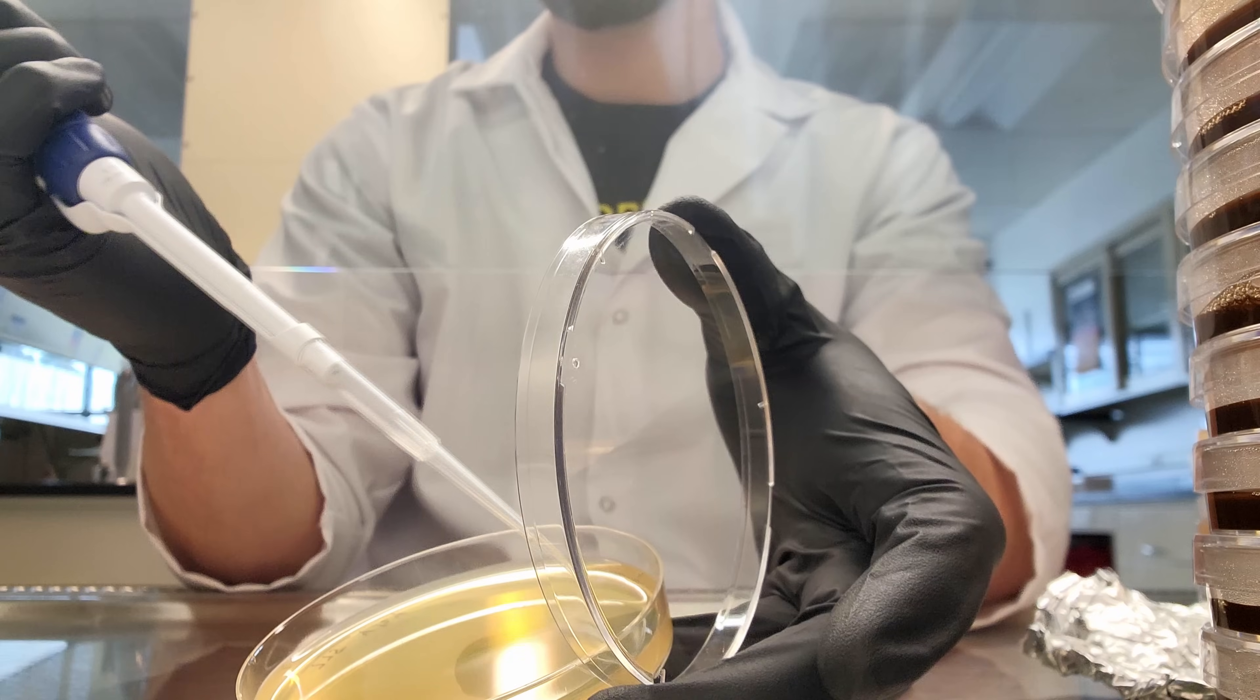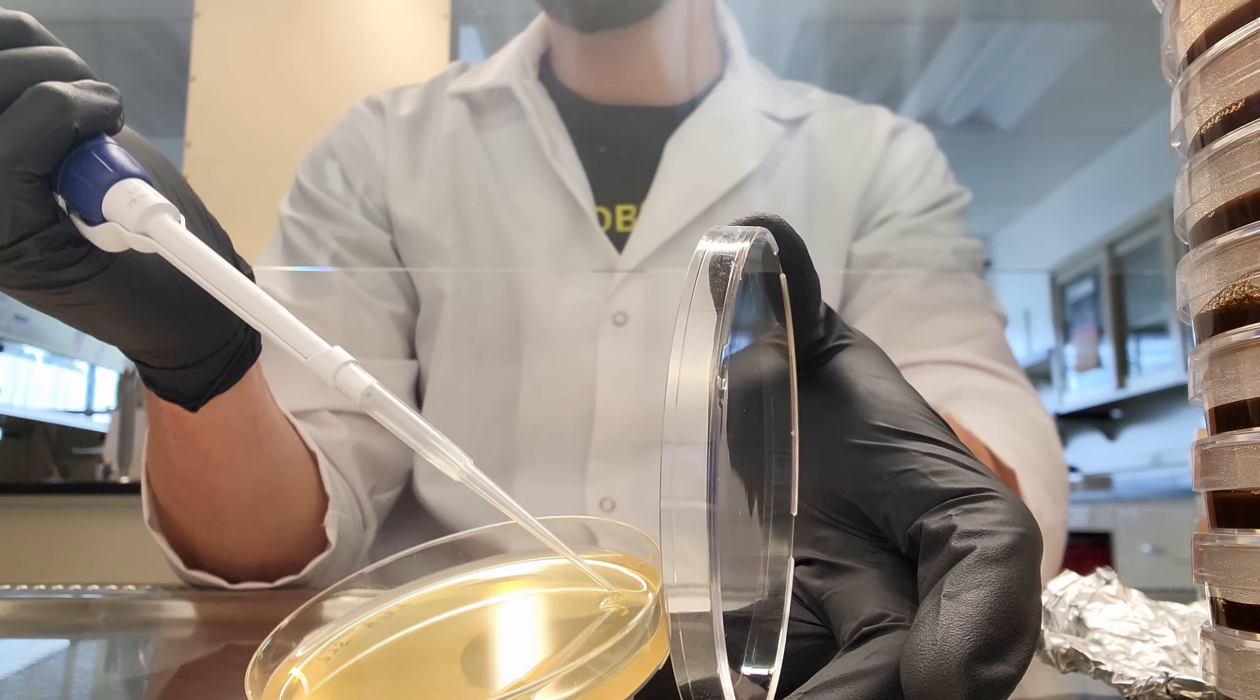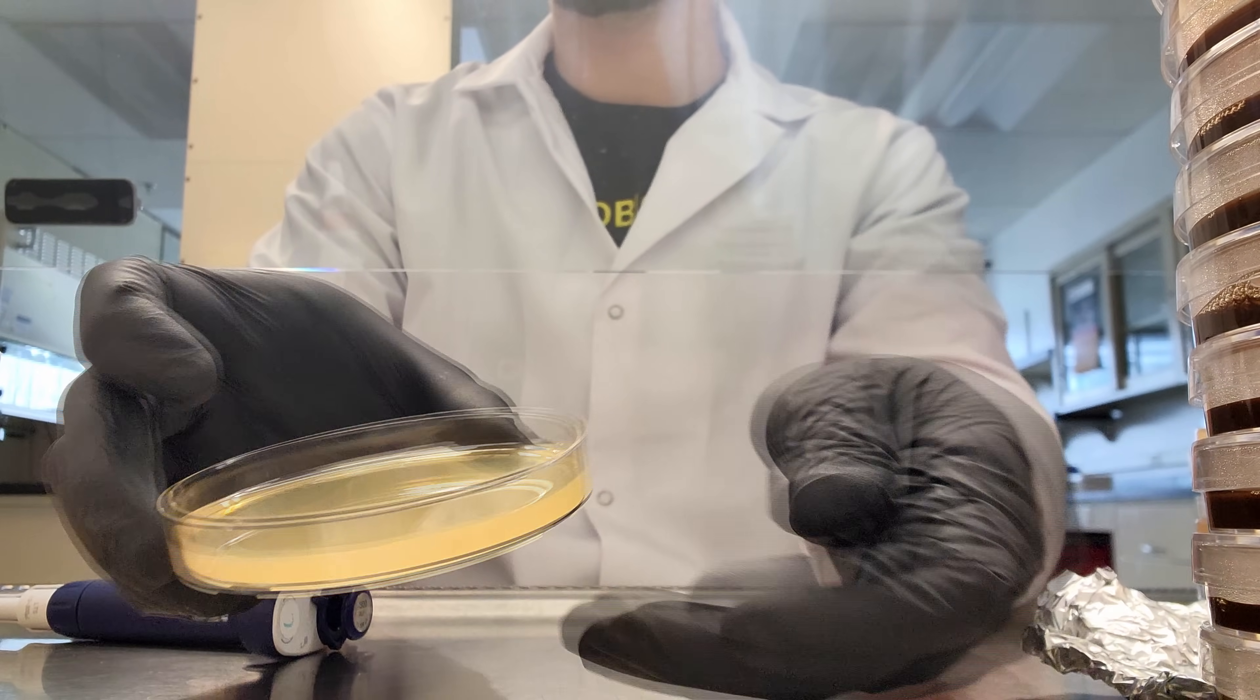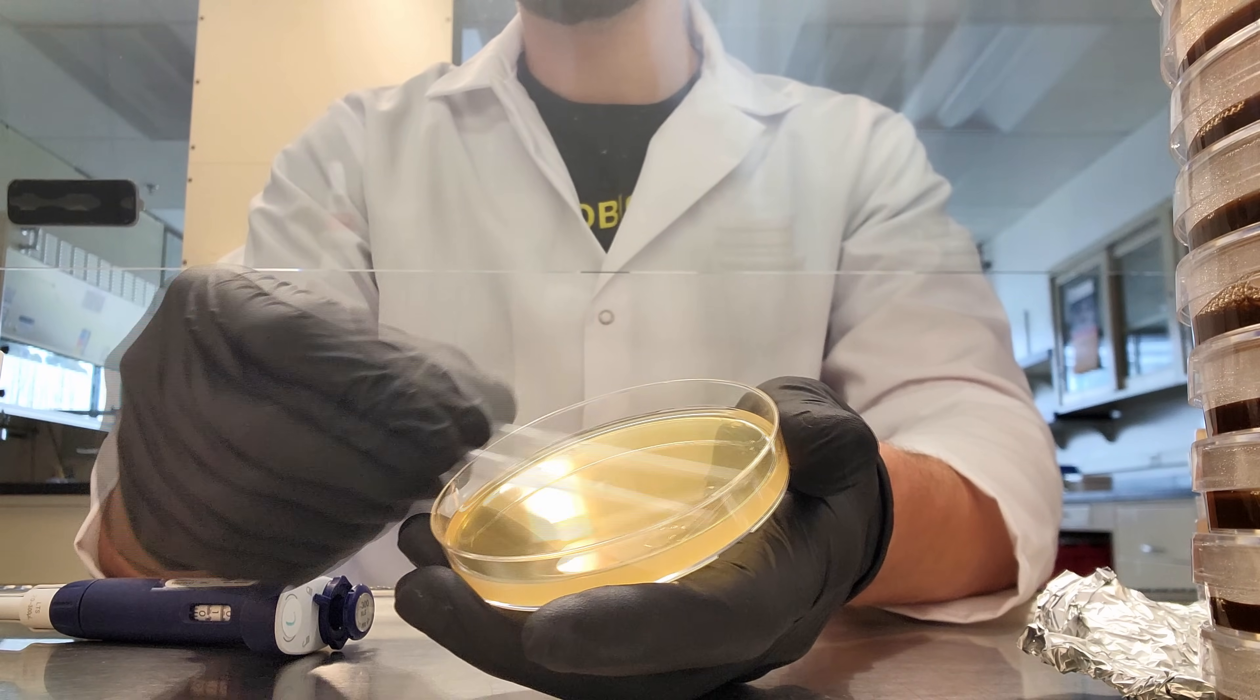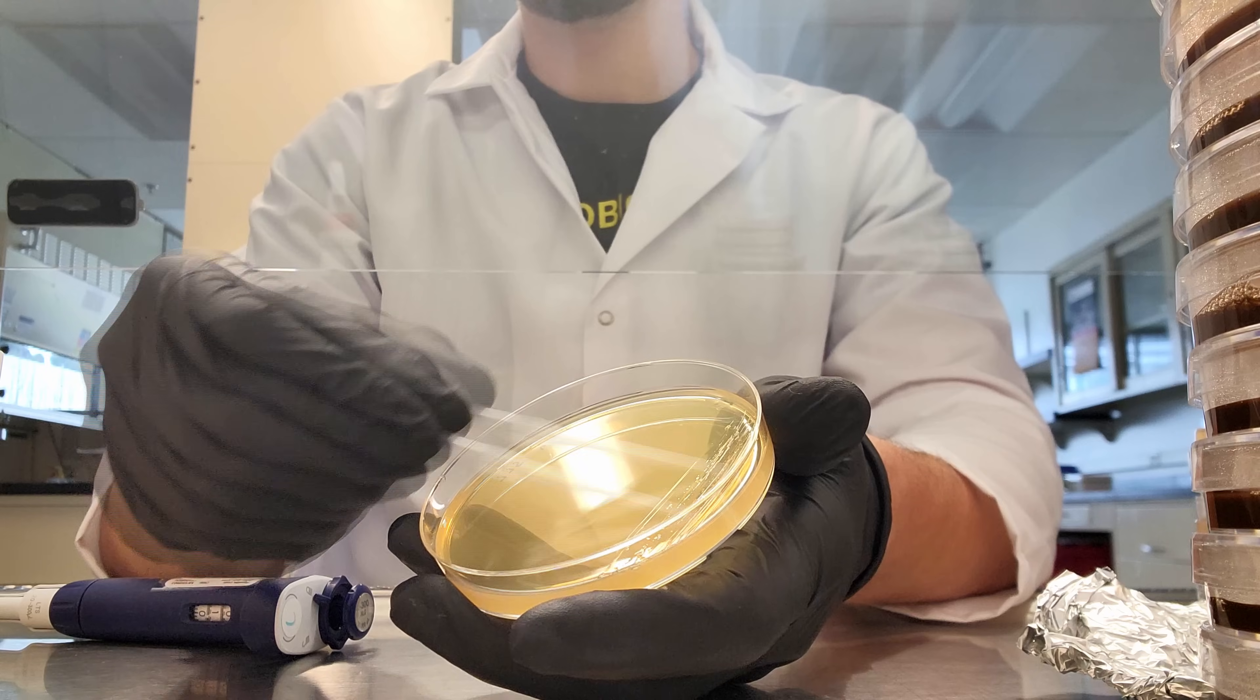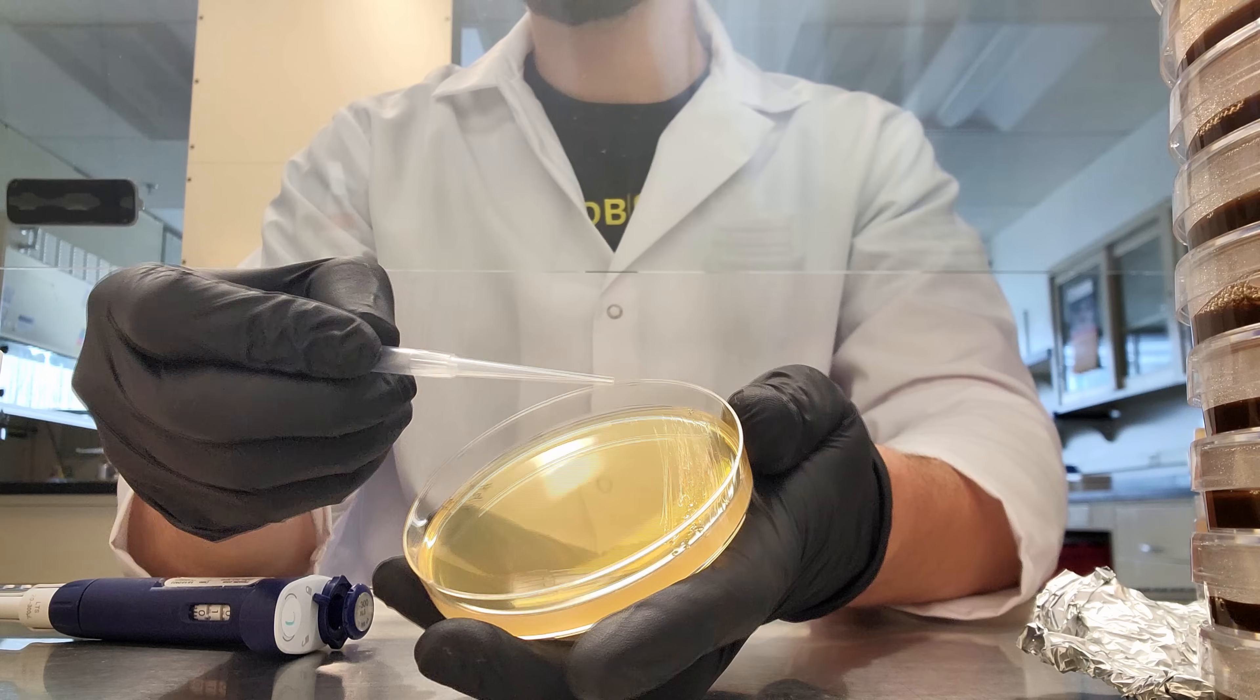These YPD petri dishes are mostly dry, so when I put 10 microliters on and rub it around with a new pipette tip, it's going to absorb into the agar and dry out. That is really important—no matter what you're plating, when you plate your cells, the petri dish should be dry when you're done.